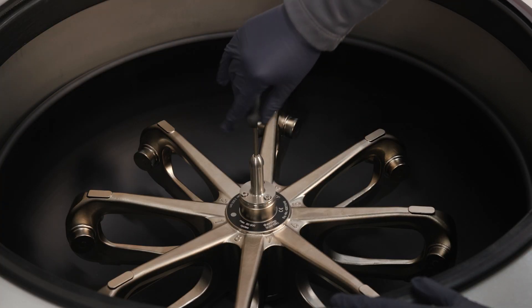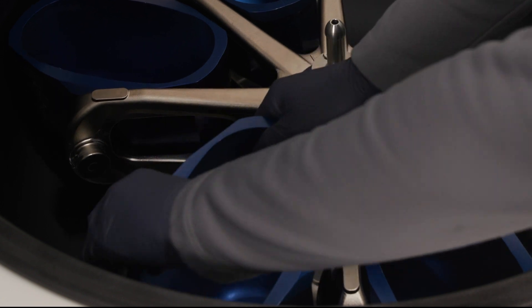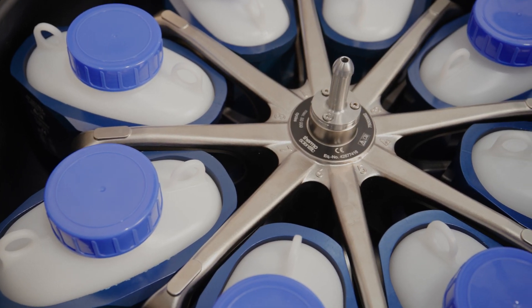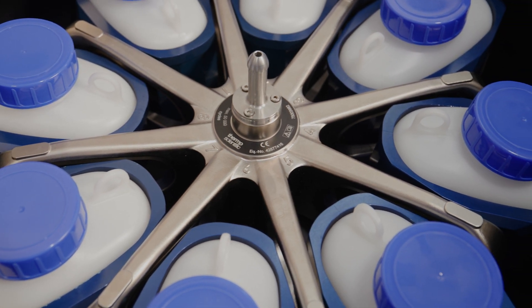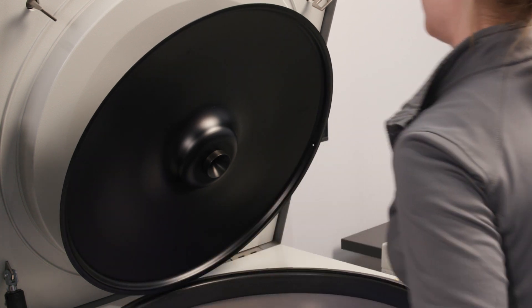First, you'll want to ensure you only use properly installed rotors. Do not use rotors, buckets, or components that show any signs of damage to the protective coating, corrosion, or cracks. Contact customer service for further advice or inspections.